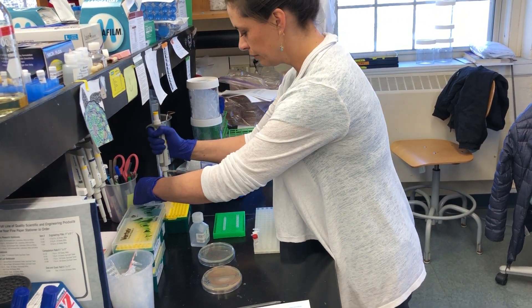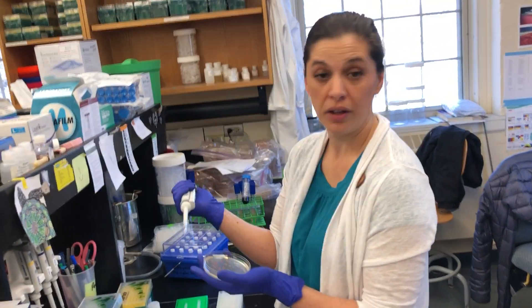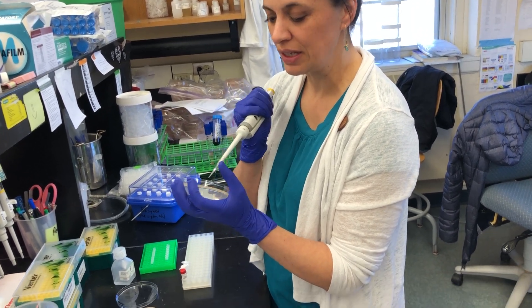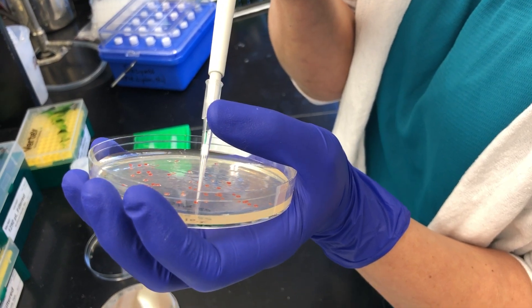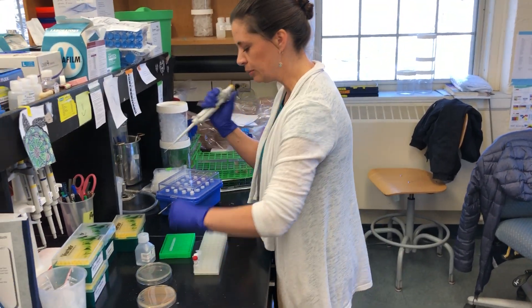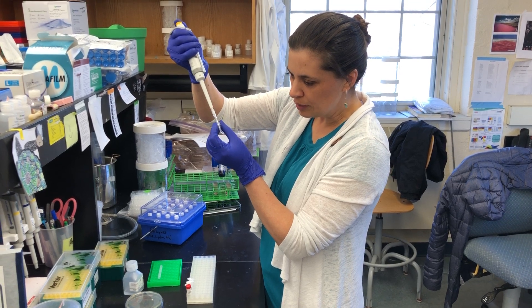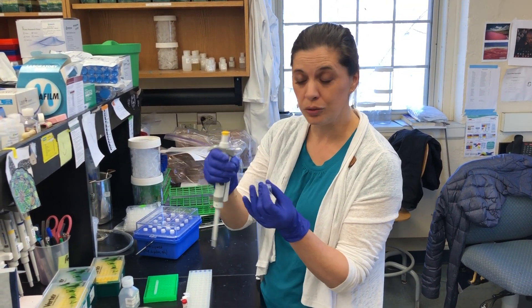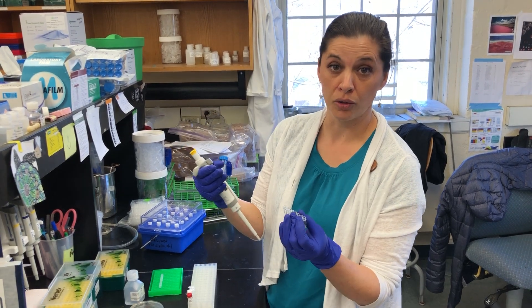I'm using a wild type control. To screen directly from colony, I just use a very small tip and I stabilize the plate in one hand, then stick out a thumb to stabilize my tip with the other hand. I depress the plunger of the pipette and just grab just a few cells from the colony. I put that tip right into my PCR reaction and pipette up a few times. Sometimes you see a bit of pink come off, but preferably you won't. All you'll see is the lysed intracellular goo kind of sticking to the tip as you draw it out — that way you know you have some DNA in there, but not so much that it's going to overwhelm your reaction.